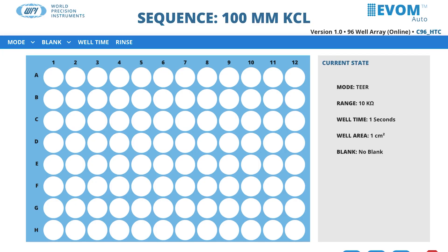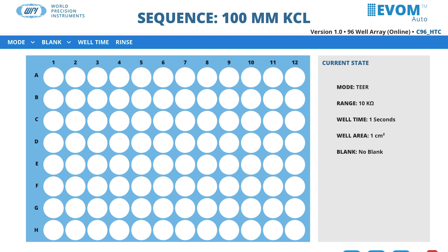Select your Blank option. This option measures the resistance of the first column — wells A1, B1, C1 to H1 — and this value is used as a baseline for each row. Each value on the blank value table measures the resistance of the specific electrode pair used to measure each column on a well containing only buffer. These values, values 1 through value 8, are subtracted from the measurements on the corresponding row to obtain the change from the baseline well.